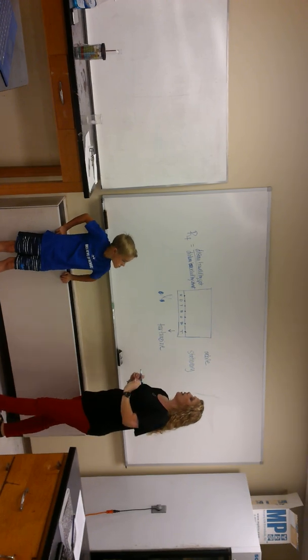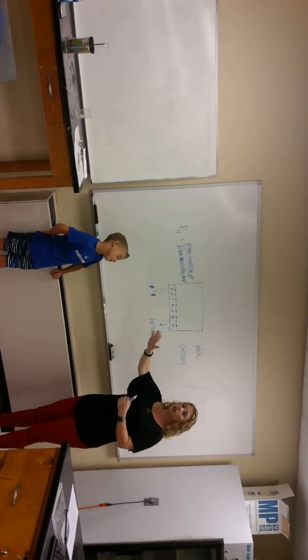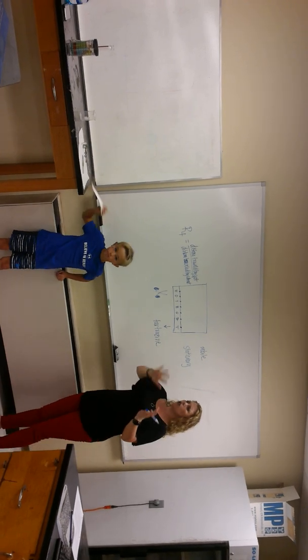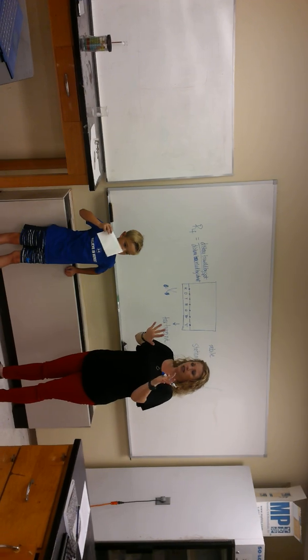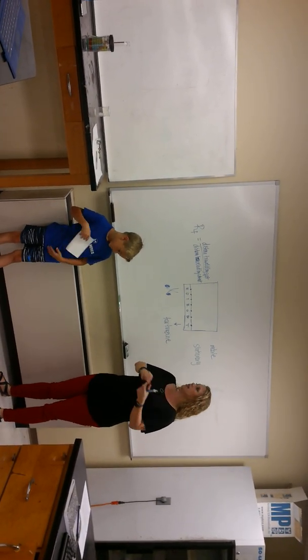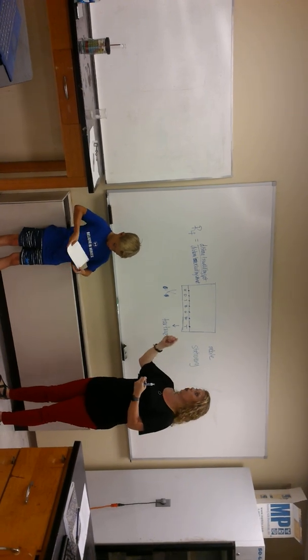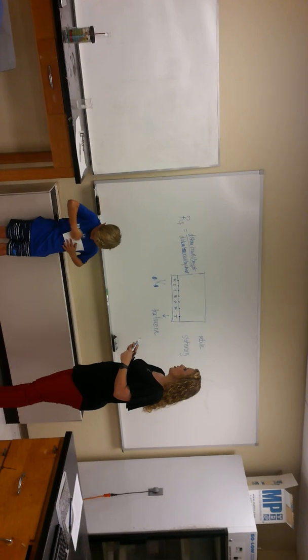Okay? All right. So we're going to dot those, and to practice, because our chromatography paper is pretty expensive, we don't want to mess that up. That's right, you don't want to mess that up. You're going to get one sheet, you don't want to mess it up. We're going to put some filter paper out there, which isn't as expensive, for you to practice dotting on, so that you can practice it before you get to your piece of chromatography paper.